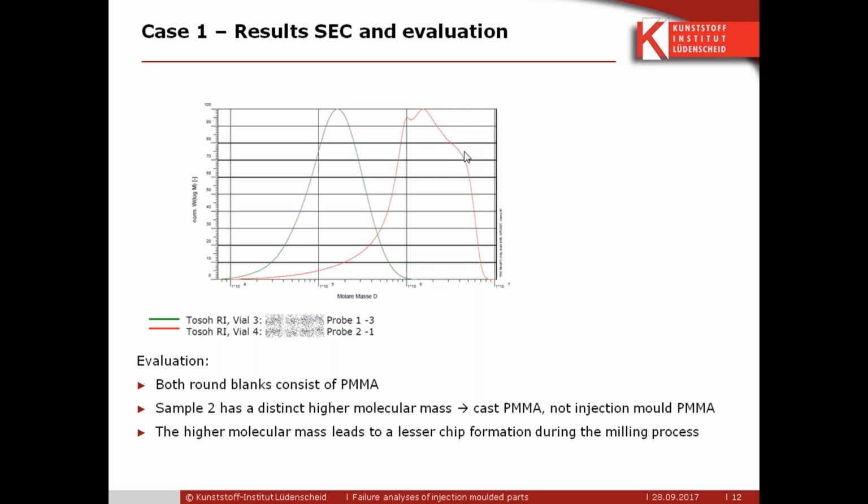We see in the second heating run, we start with that, slightly differences in the glass transition. 2 degrees is not so big that you can clearly say there are big differences, but you can see you have just this one glass transition, and this is within the typical range of PMMA. So this analysis gives us the information that it is an unmixed PMMA too.